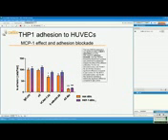We also try to use chemokines in combination with cell treatments, and also try to inhibit the adhesion of THP1 cells to HUVEC by using the antibodies. So in this case, HUVEC were treated with respective monoclonal antibodies for VCAM, E-selectin, or in some cases we use both of the antibodies together.